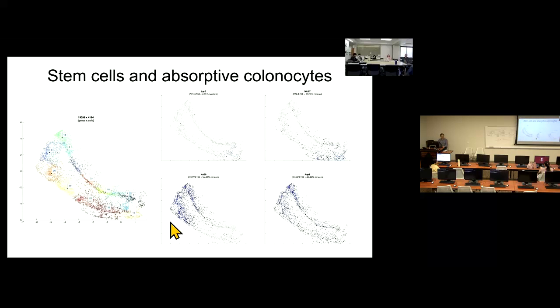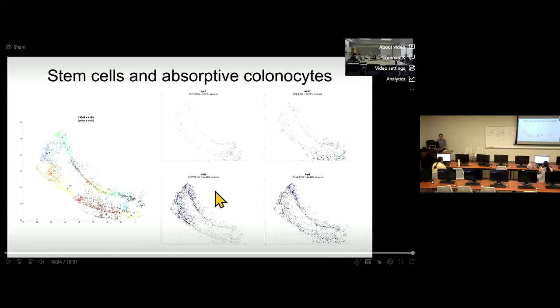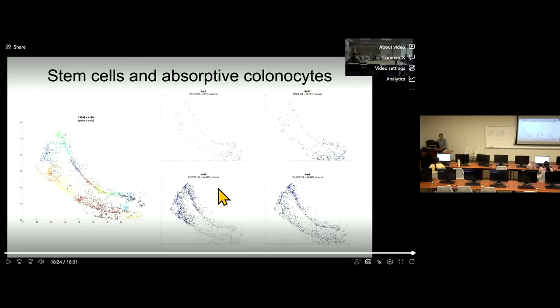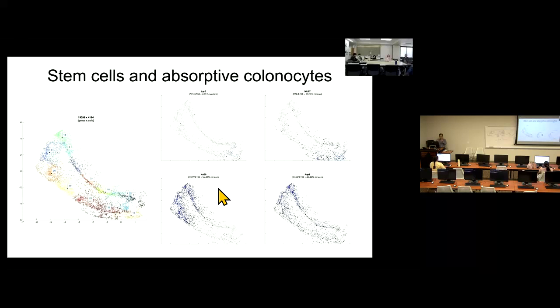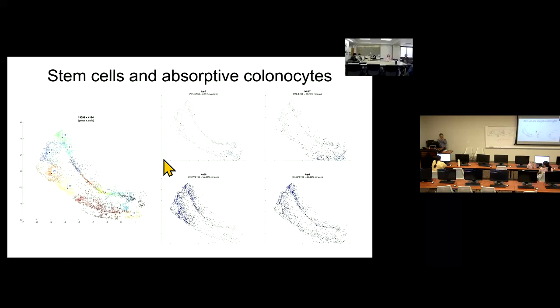Okay, so this is Dr. Michael Salinas. He did this analysis a year ago using the toolbox and focused on the subclusters. So we separated the cells into many different small clusters and deal with maybe one cluster each time, or consider several clusters as a whole subtype of cells.